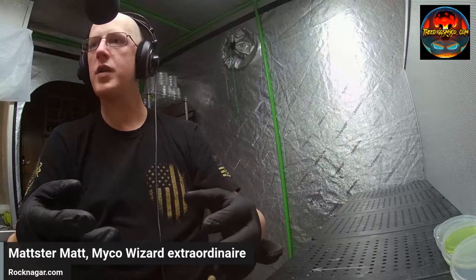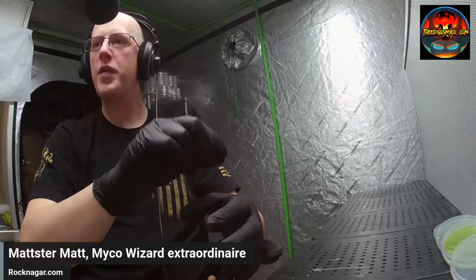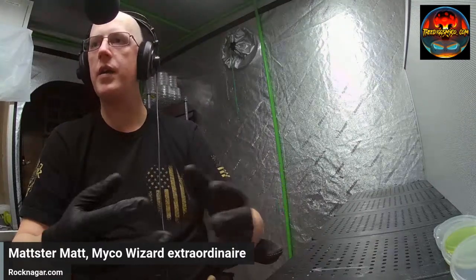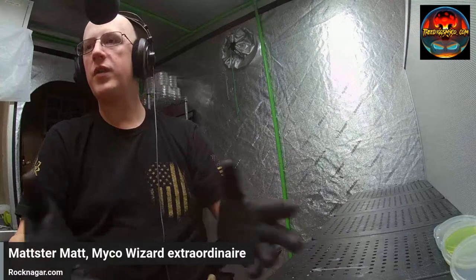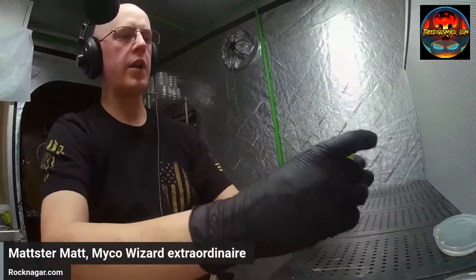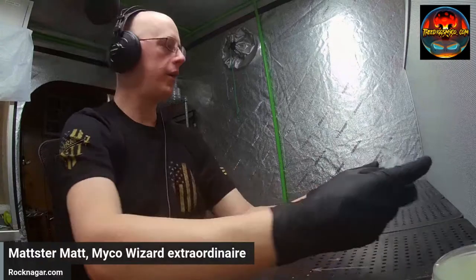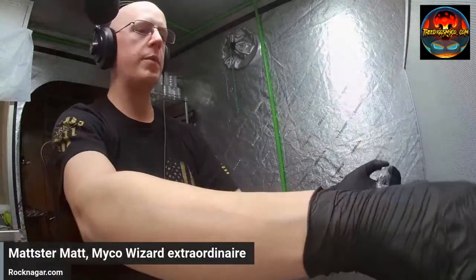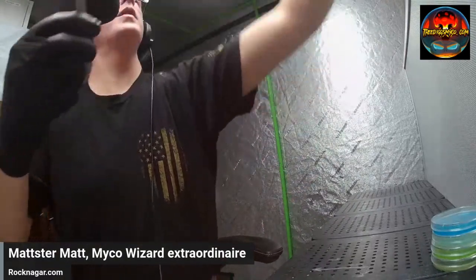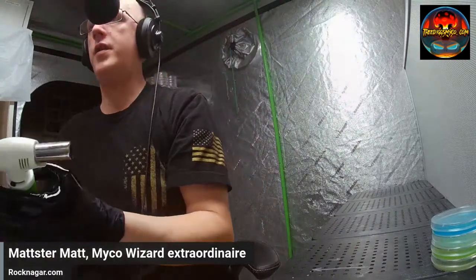Before, I would draw the design and cut out a trench where I thought it would need nutritional agar or a different colored agar to make it special. But that's more for the art side of it rather than the mycelium growing in an artistic style. So this way I just put little cuts in my plate. And of course I put my scalpel and torch away because I was being a good boy and cleaning up my work area. So we'll be a good boy again and sanitize up.